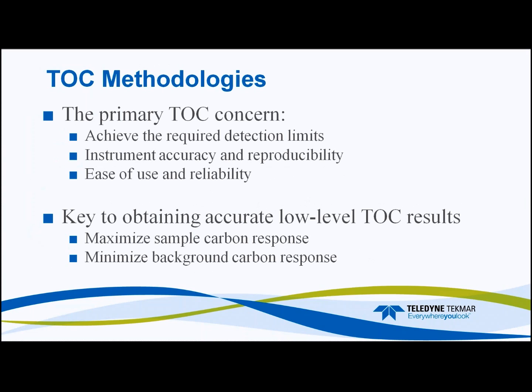So when we look at different TOC methodologies, the primary TOC concerns are, can we achieve the required detection limits? Whether we're looking at clean water samples or wastewater samples, it seems like most of our methodologies are pushing us to get lower and lower on the detection limit scale today, whether in our reporting limits. So that can often be a challenge for us.